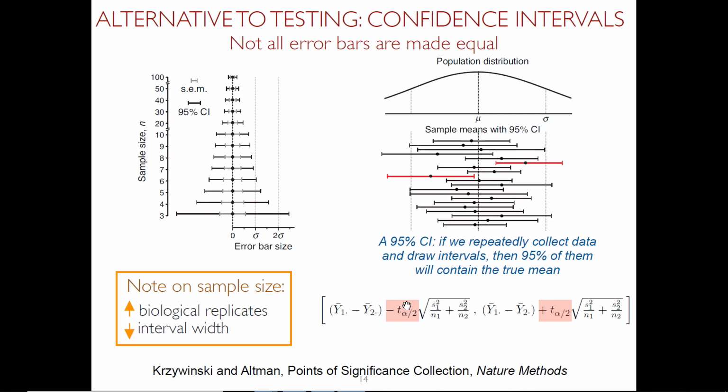Another way to report the results is in terms of intervals. The good thing about p-values is that if you have a list of many proteins, you can just compare whether the p-value is less than 0.05 or not, and then you make your decision. But then you lose the information about was it upregulated, downregulated, by how much, right? So you lose all of that. Using intervals would be another way to keep this information, but also provide a sense of how much uncertainty we had in these log fold changes.